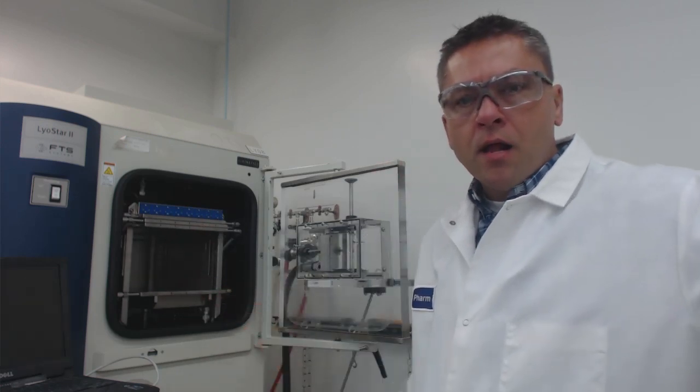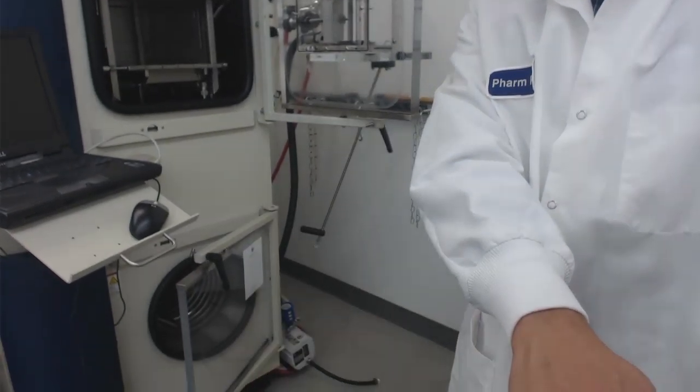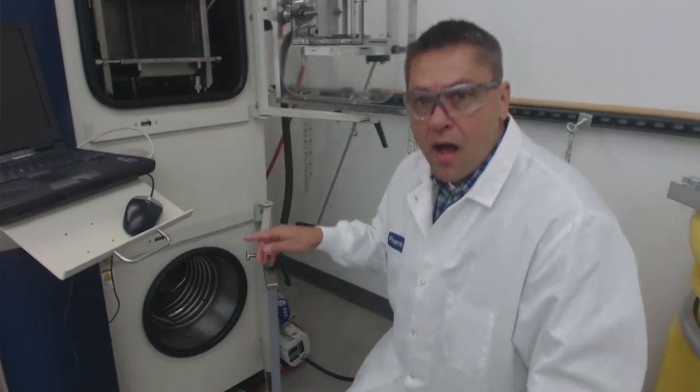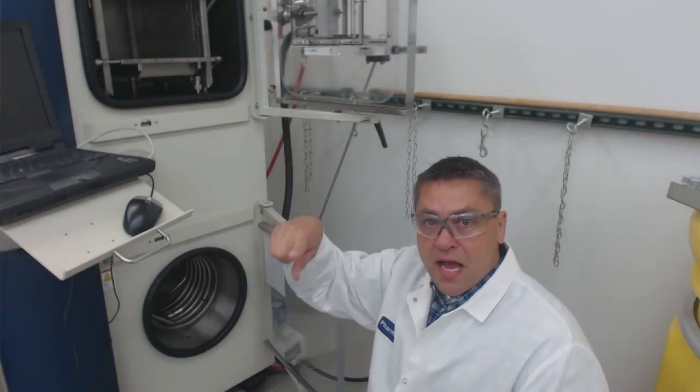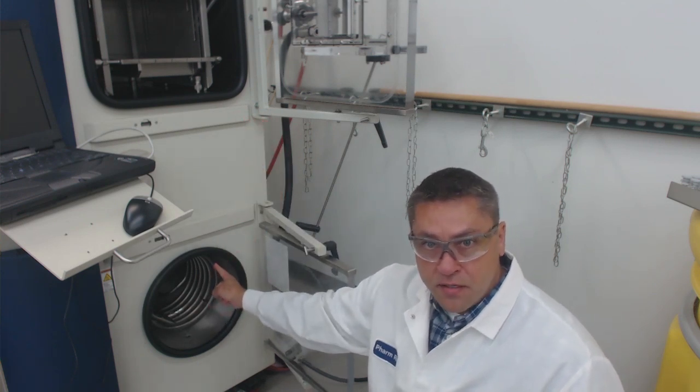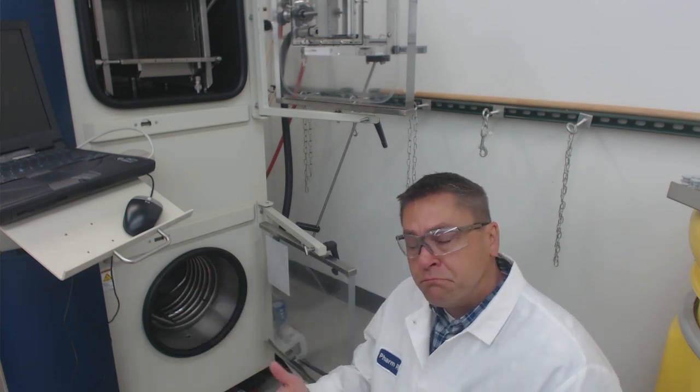For ease of demonstration during this video, I've raised the top two shelves. If we look a little farther down, we see the condenser. The condenser is where ice, as it's removed as water vapor during the sublimation, is trapped on these coils. These coils are kept at a temperature of around minus 65, minus 70.